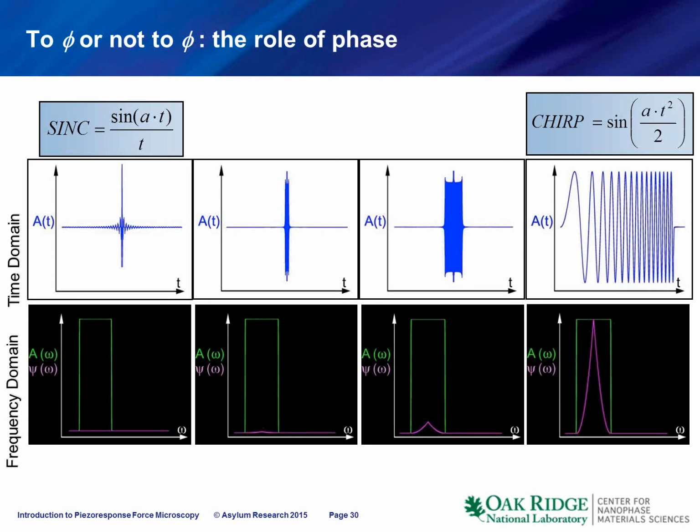If we start to tweak our excitation phase, we can make the distribution of the signal in the time domain more uniform, and in the limit we will have basically a chirp signal. So we can tune our excitation to serve our purposes. Do we want a cleaner response, or do we want a more intense response?